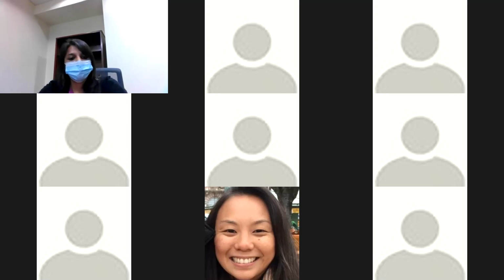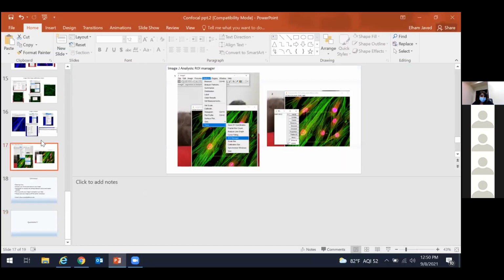Yeah. So that ROI manager, oh, I maybe should not have stopped sharing my screen. The ROI manager option that I told you about is pretty much for that. If you look here, that's basically what it does.